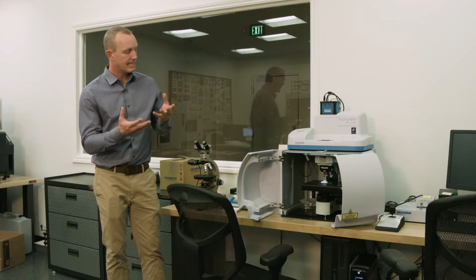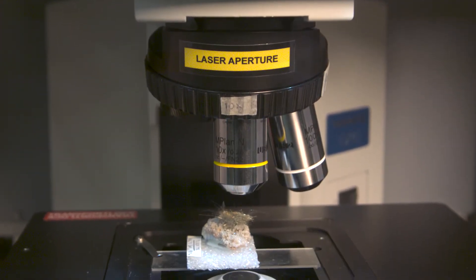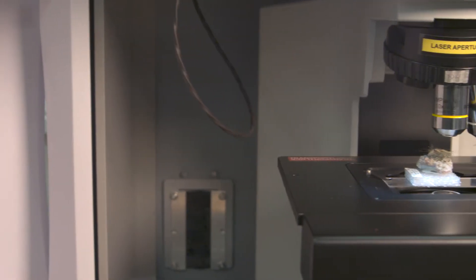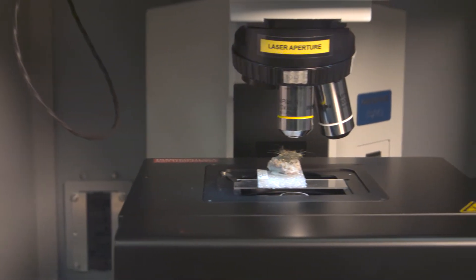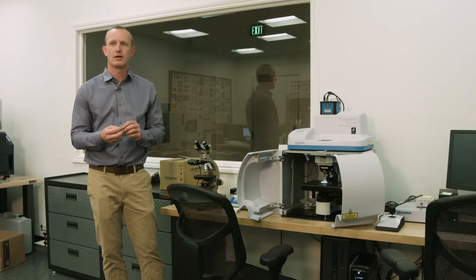Light hits the mineral and some of the energy is passed to the crystal itself and re-released at different wavelengths. That characteristic change in light frequency is very diagnostic to how the minerals are arranged in space, so we can use this tool to measure distortions and geometries of atoms very precisely.